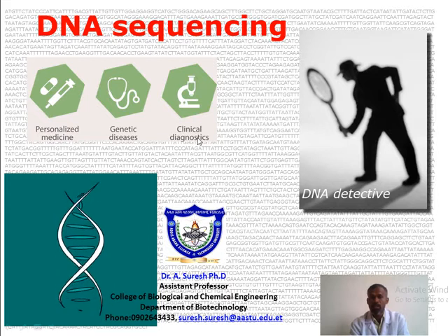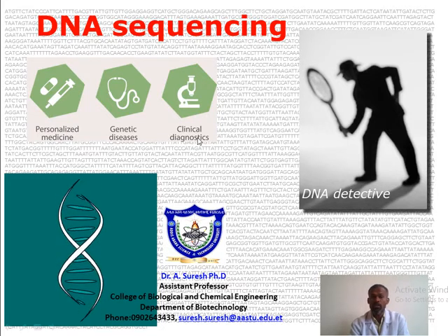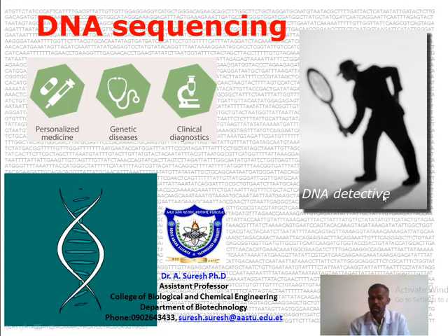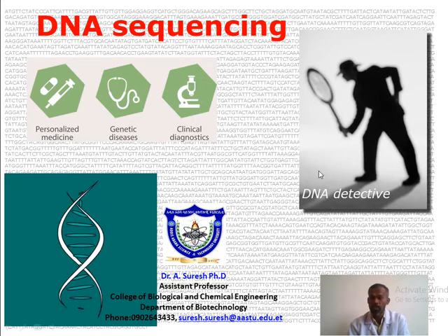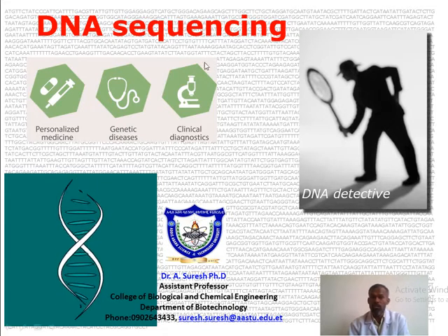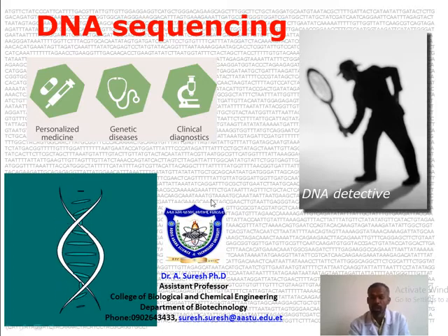Okay, so DNA sequencing is very important nowadays for personalized medicine, genetic diseases, clinical diagnosis, as well as crime detection, DNA detective work and fingerprinting. So DNA sequencing in future is a very important technique. So in this video I will let you know how to do this.